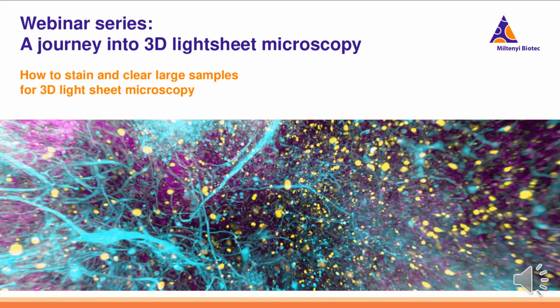So the first question that I have that's come through is, how long does it take to do the whole pipeline, including staining and clearing?